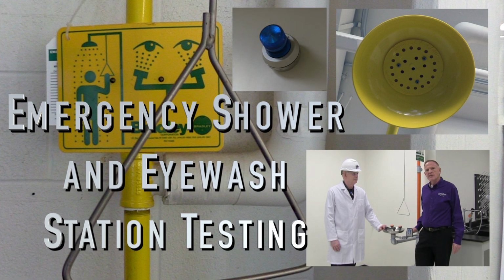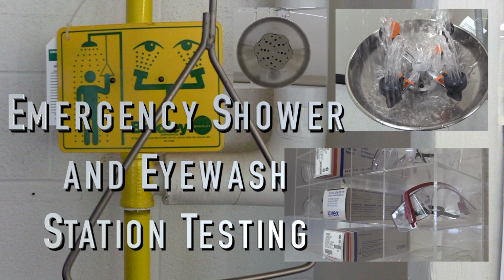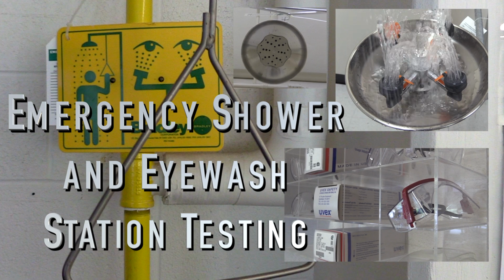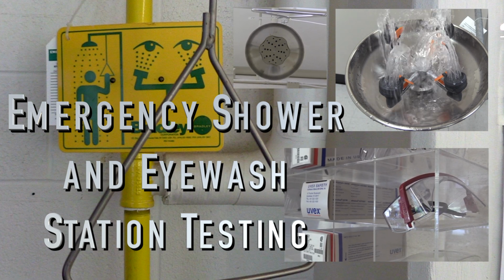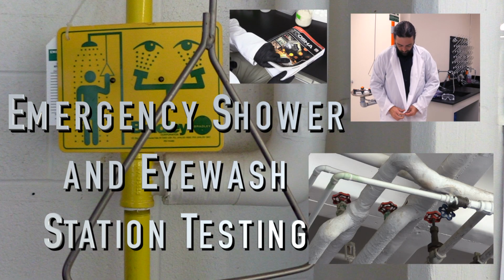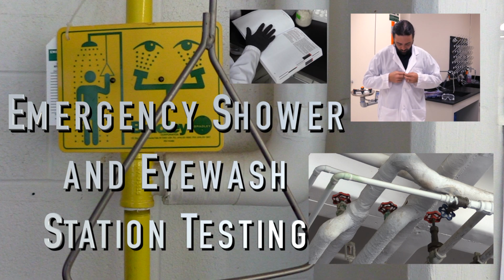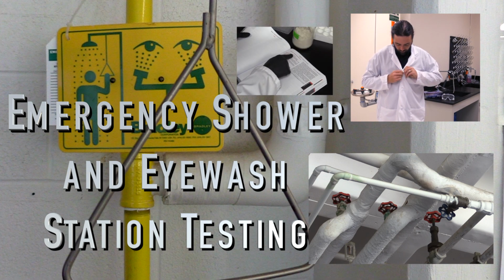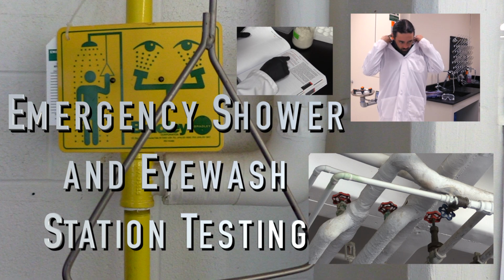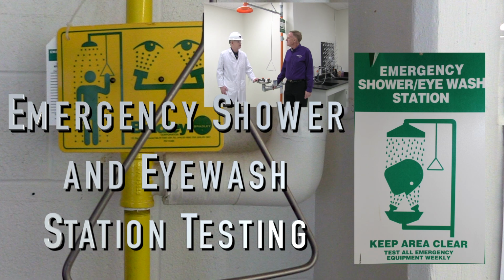The purpose of this training video is to review procedures for emergency shower and eye wash station testing. In this presentation you will gain an understanding of the general requirements for operation and maintenance of the emergency shower and eye wash stations, be able to identify the appropriate type of personal protective equipment required when testing, examine the necessary steps involved in the testing procedure, determine what to do in the event the equipment is damaged, and ascertain the required employee training elements to incorporate into your program.